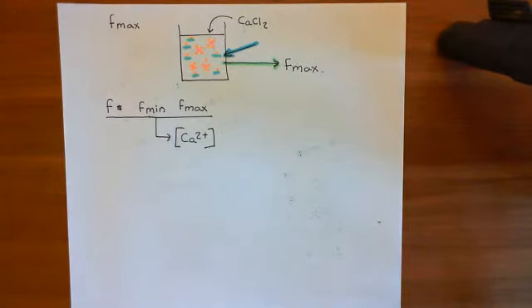Finally, we'll completely saturate the Fluo-4 molecules with calcium. So we'll put in loads and loads of calcium chloride, firstly to saturate the BAPTA molecules, and then to saturate all the Fluo-4 molecules, so that every single Fluo-4 molecule in that glass, to all decent approximations, has a calcium ion bound to it. Of course, there might be one or two that don't, but that's negligible.